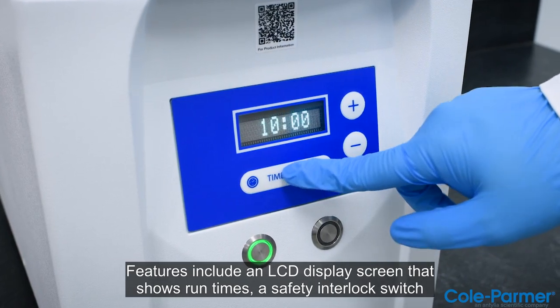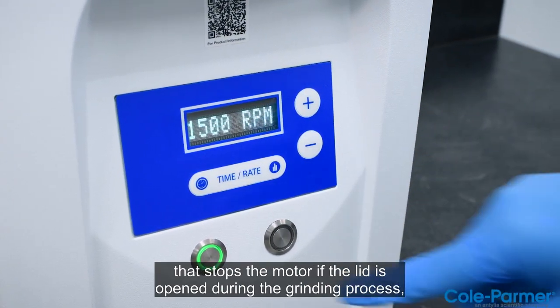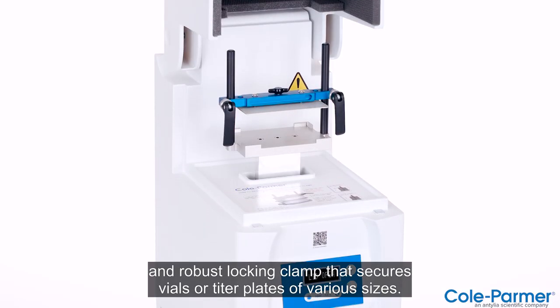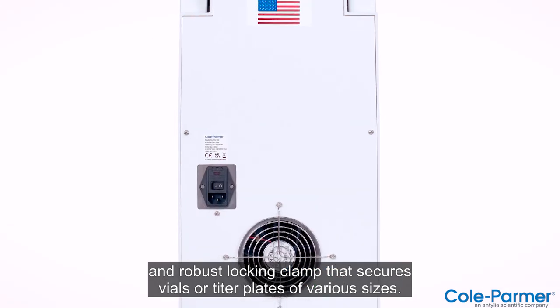Features include an LCD display screen that shows run times, a safety interlock switch that stops the motor if the lid is open during the grinding process, and a robust locking clamp that secures vials or titer plates of various sizes.